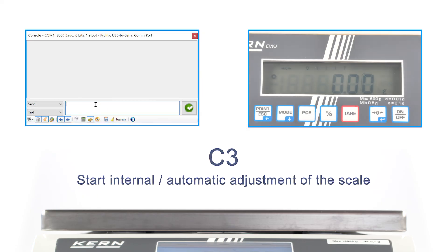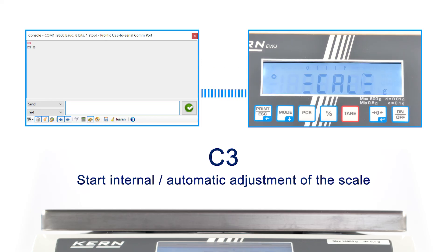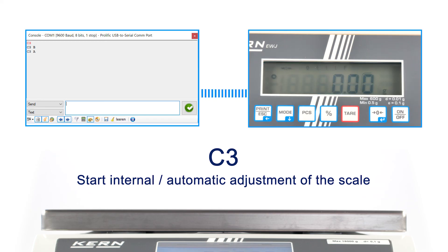The internal adjustment of the balance can be started. The fully automatic adjustment of the balance is also shown in the balance display. After completion, a confirmation is sent back. Afterwards, the scale changes back to weighing mode.